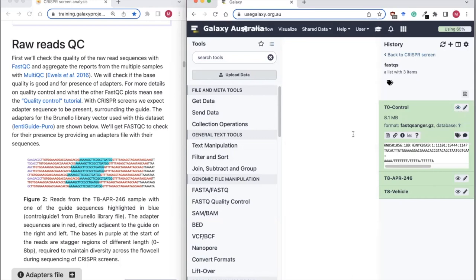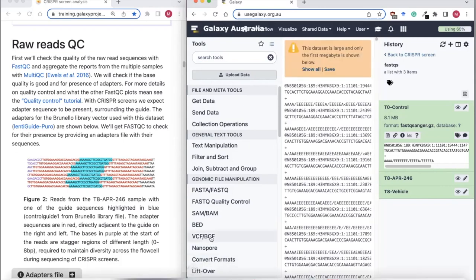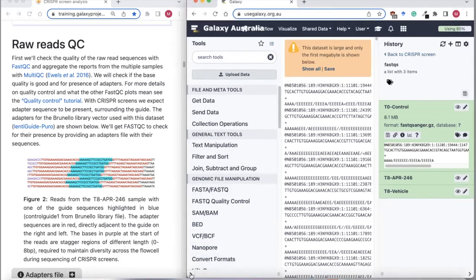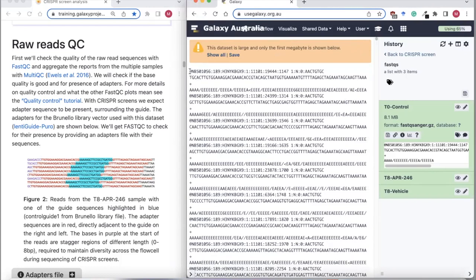If we click on the eyeball, I can have a look at the file in the main pane. These are our reads — each of these four lines is one read. The first line is the read name, then we've got the sequence for the read. In this case there are 75 bases for the spacer, plus the quality score for each of the bases.